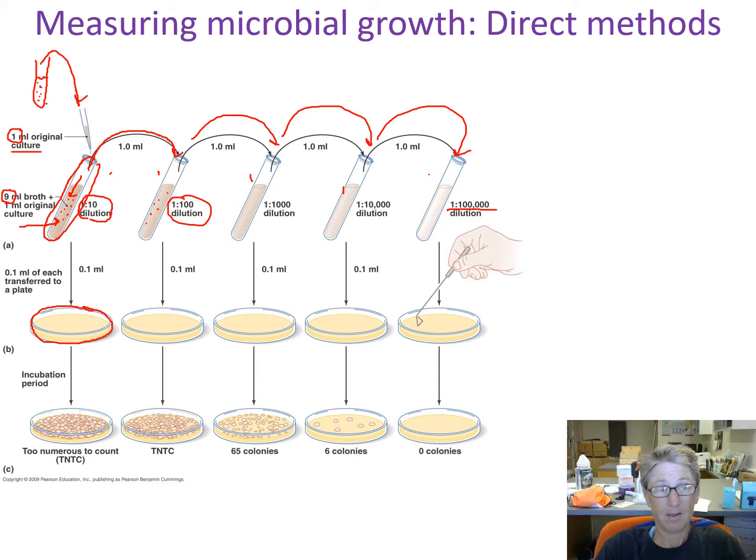And then from those 5 culture tubes, you take out 1/10 of a ml, that's 100 microliters, out of this sample. And then you use, see this thing over here? Let's look at the hand. So here's the hand. You've got this thing, it's called a cell spreader. So you put your drop, your 1/10 of a ml, aka 100 microliters here, and then you use this guy over here, a cell spreader, and you just spread your 1/10 of a ml of broth with microbe in it.